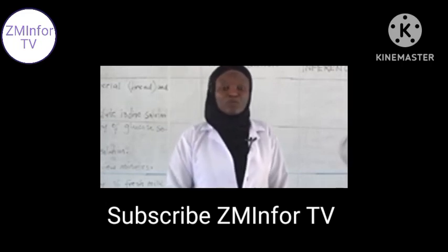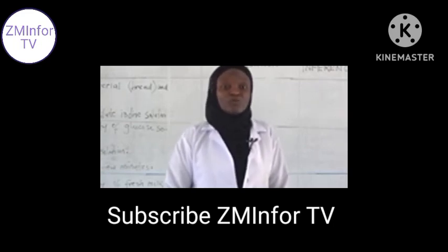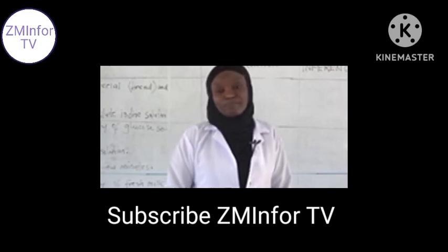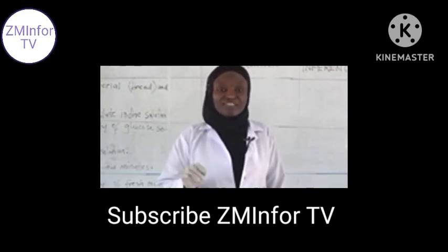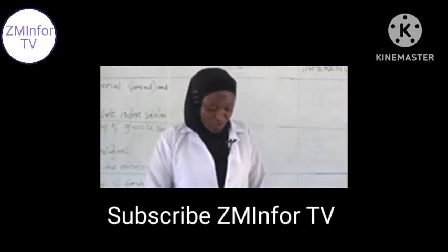Because you are supposed to see clearly, and after seeing, you are supposed to draw exactly what you see. So the first thing is for you to observe. You use your eyes to see clearly whatever you are provided with.